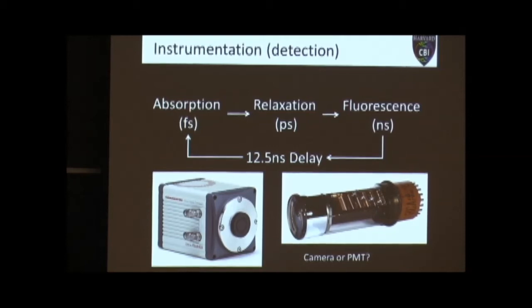And because of that, that really limits the detectors that we can use for this. So often in the facility, if people say, what's the microscope you can image the fastest on? We'll say the Cell Observer or the AxioZoom with one of these Hamamatsu sCMOS cameras. Okay? This is a camera that can read out the entire field of view in 100 frames per second, you can do a smaller field of view in 800 frames per second, I believe. So it's really, really fast. But that's not fast enough for doing this.